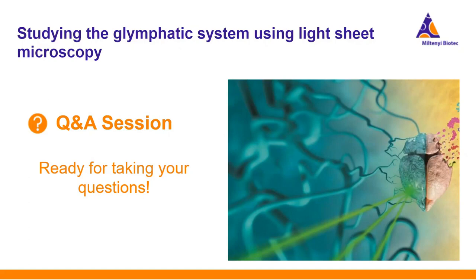Yes. On our light sheet microscope, we have 7 excitation emission filters installed. But at the moment, we would like to stick to 2 fluorophores. We know, for example, that the far red fluorophore is very good.